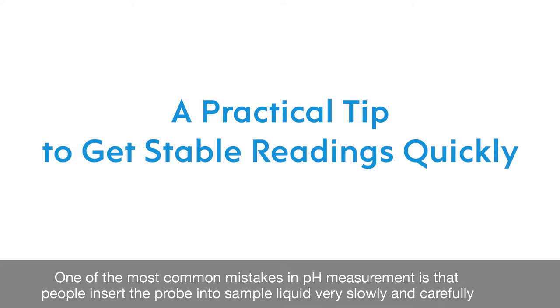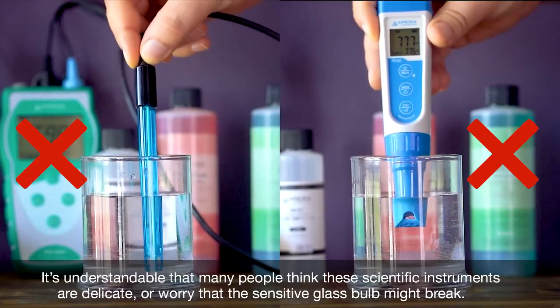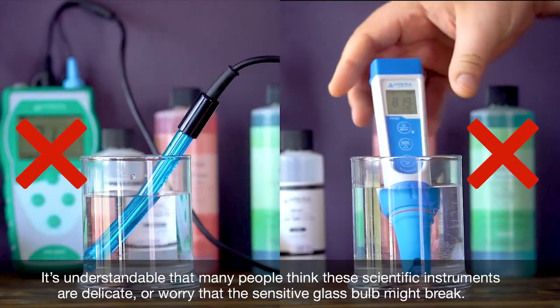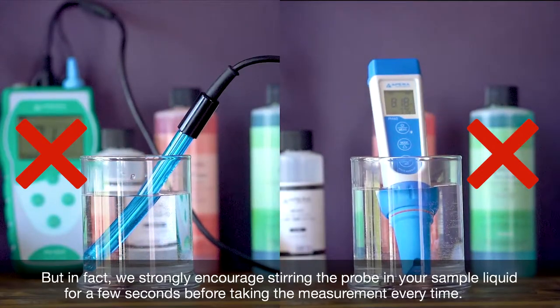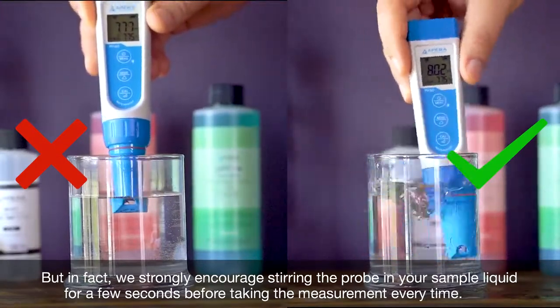One of the most common mistakes made in pH measurement is that people insert the probe into a sample liquid very slowly and carefully. It's understandable that many people think these scientific instruments are delicate or worry that the sensitive glass bulb might break, but in fact we strongly encourage stirring the probe in your sample liquid for a few seconds before taking the measurement every time.